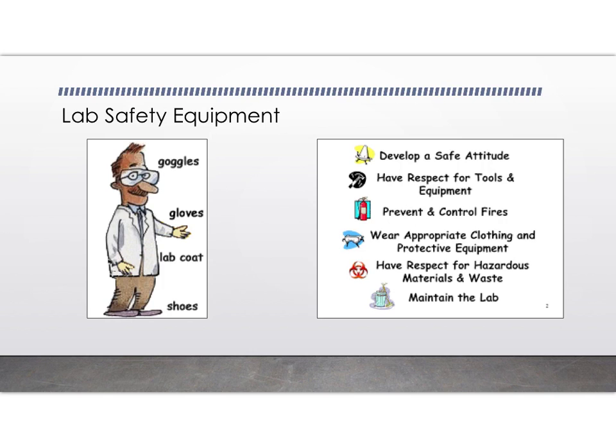So there's a couple of rules to follow whenever we go into a lab. One, you'll always be wearing goggles and lab coats, except we don't have lab coats. We will provide you with aprons. Goggles prevent different chemicals or things from coming into your eyes. The aprons prevent the chemicals or anything from spilling on top of your clothes. Sometimes we have gloves, but not necessarily all the time. But for sure, you will have to wear shoes that are closed-toed, so no sandals, nothing with your nice nail polish showing. You need tennis shoes or anything that has a closed-toed shoe.